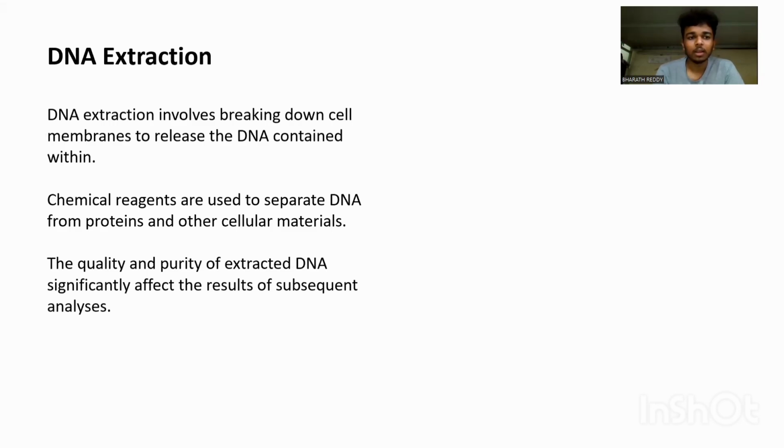Extraction of DNA. DNA extraction involves breaking down cell membranes to release the DNA contained within. Chemical reagents are used to separate DNA from proteins and other cellular materials. The quality and purity of extracted DNA significantly affect the results of subsequent analysis.